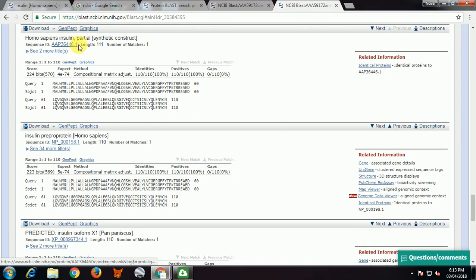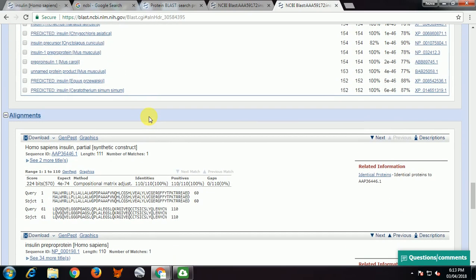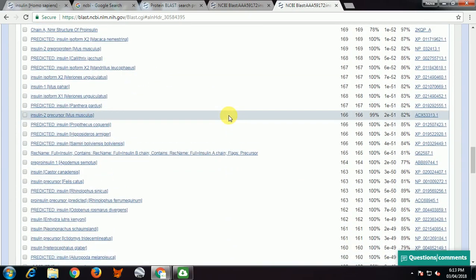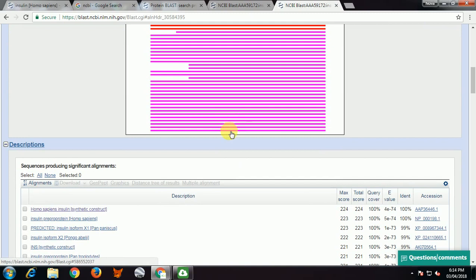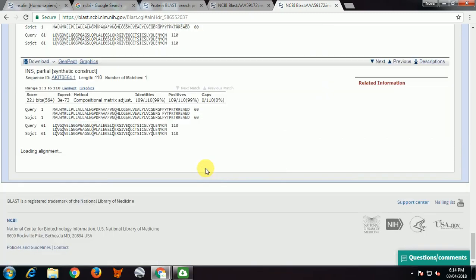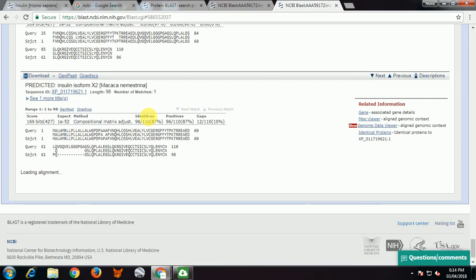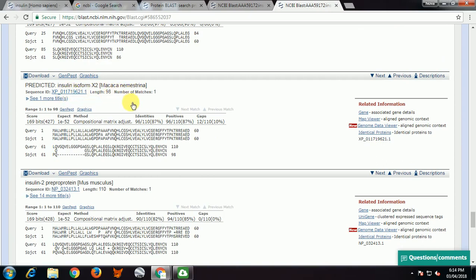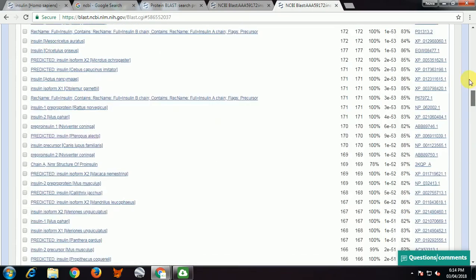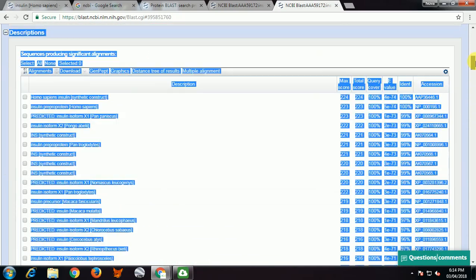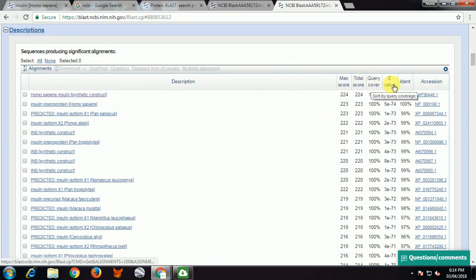The first result is Homo sapiens insulin synthetic construct. Click on that and you will be directed to the alignment result. You can see identity is 100%, positive 100%, gaps 0% — the query has been fully aligned. For the last result in BLASTP, scrolling down shows 87% identity, 87% positive, and 10% gaps.